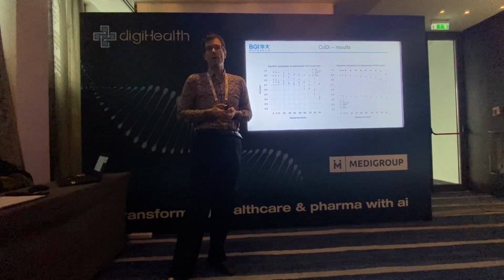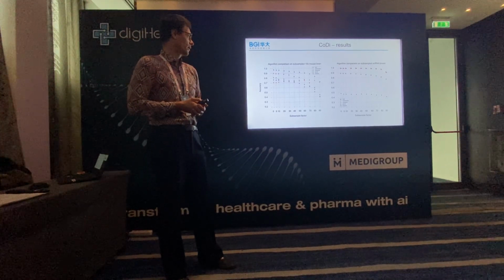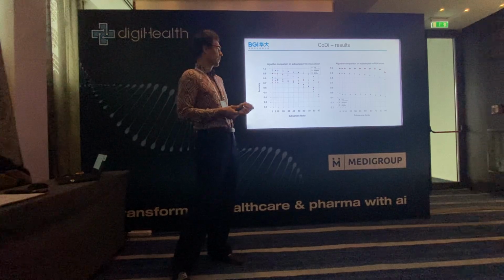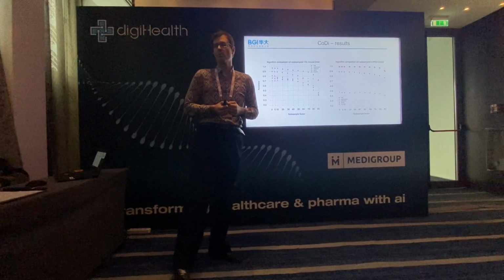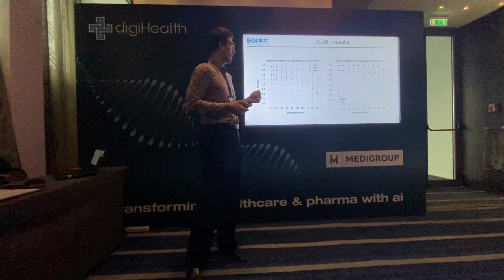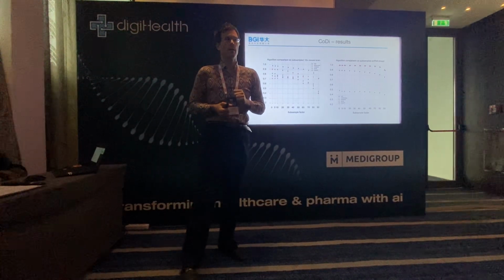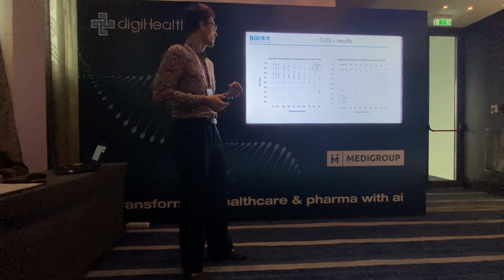Also in somatic variant calling, nowadays you have high quality gold standard reference data sets, but here you don't have that. And you need to find some mechanism or some metric to compare against the existing solutions. And in our work, we propose two metrics.